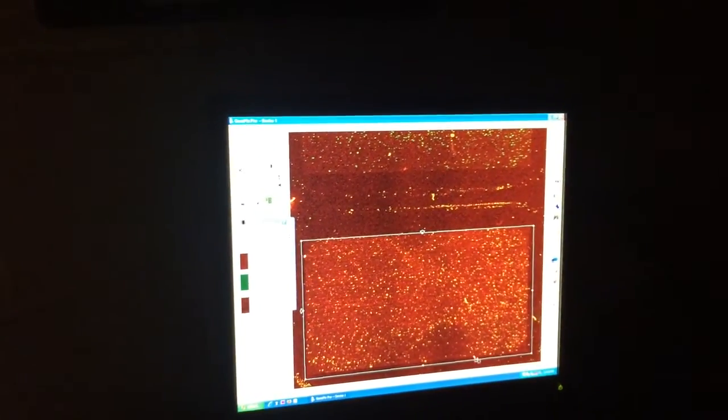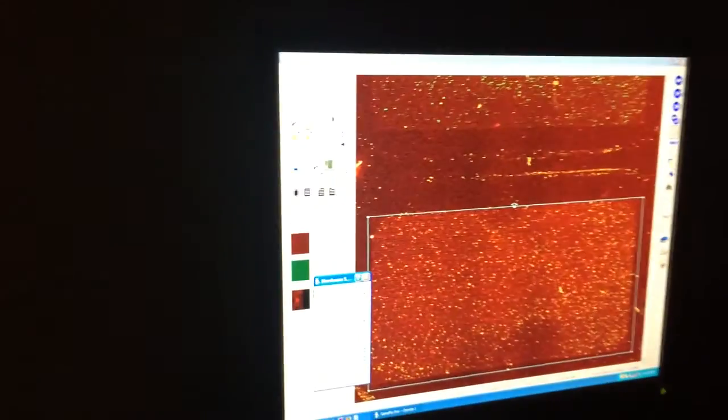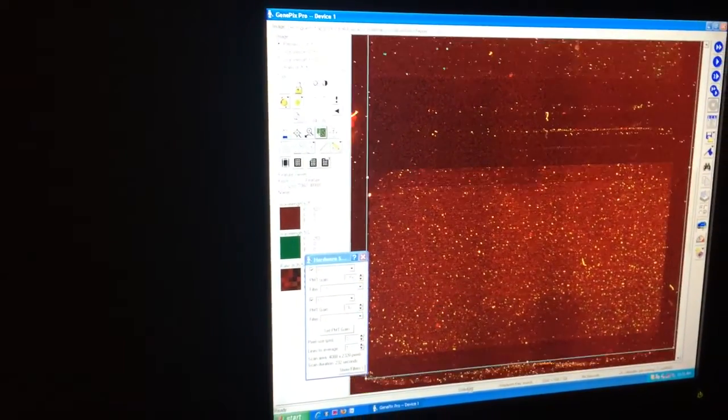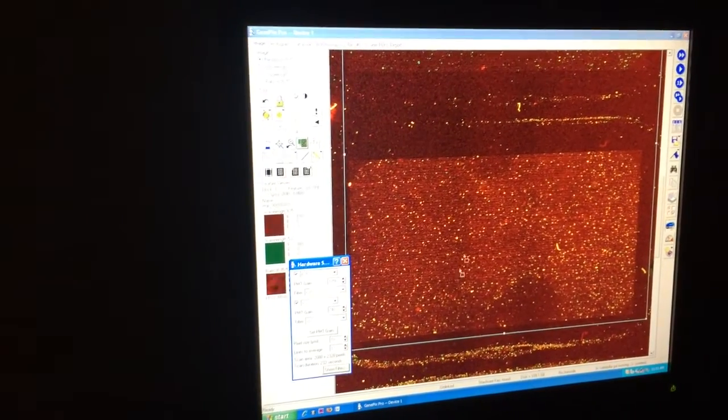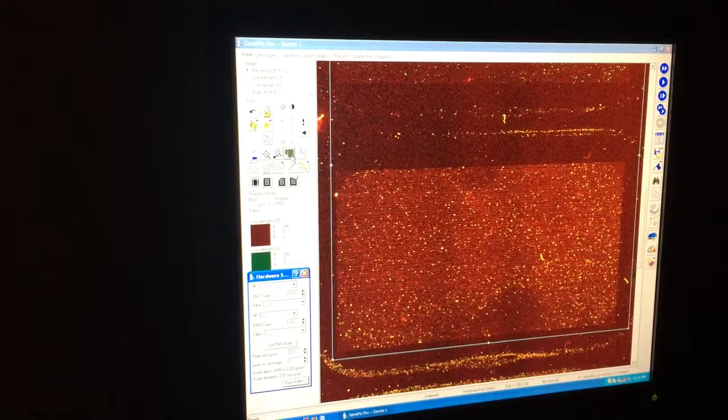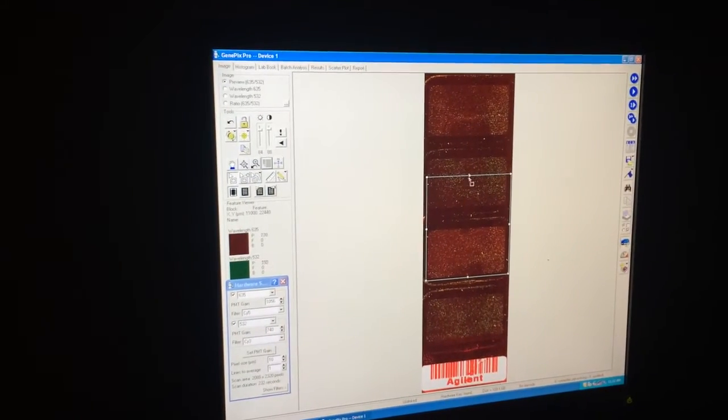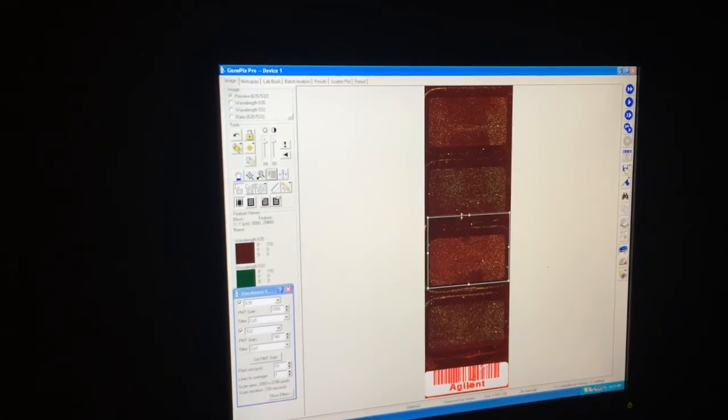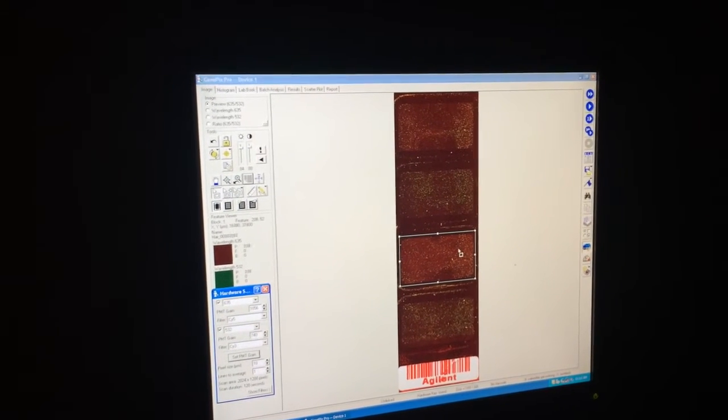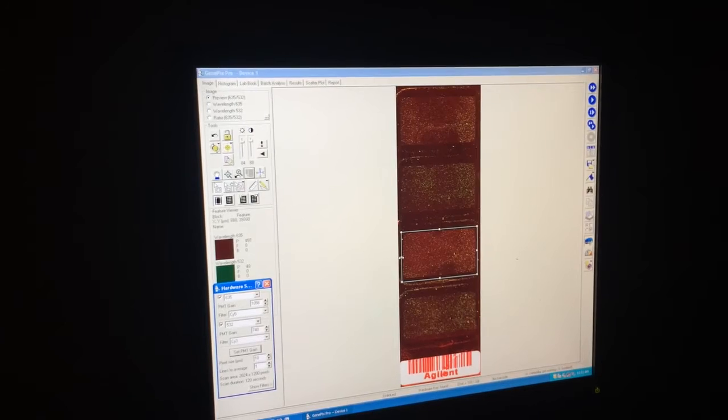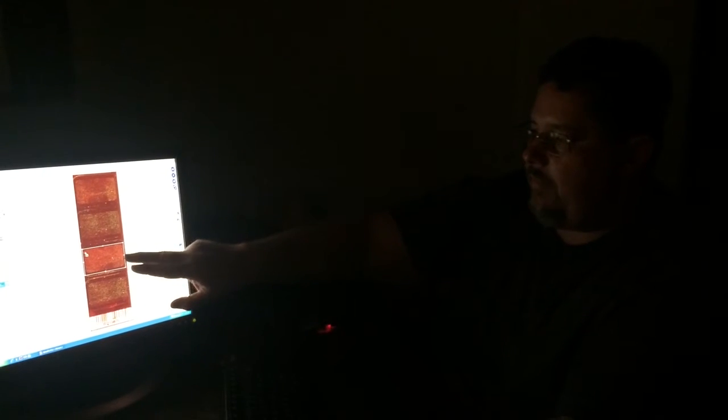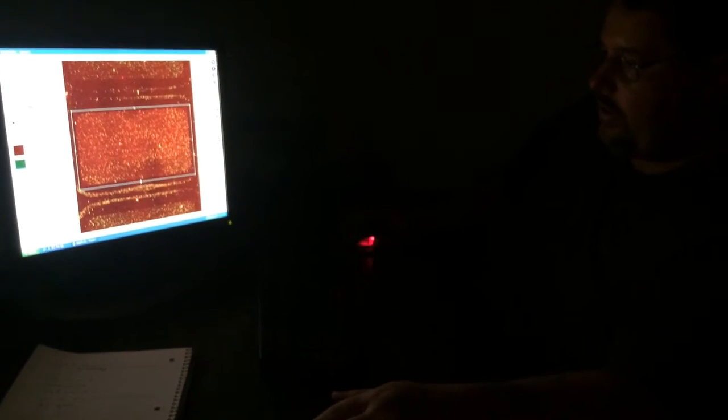So looking at it, it's kind of a mixture of reds and greens. We're going to scan it now on a more refined scale. So now I'm going to hit another button that allows me to do a more fine scale scan. I'm actually going to move this down here. I'm going to hit the overall view. So we're just going to tell it to scan just this array right here. So I'm going to draw this down around the actual block. This saves memory by keeping it just in one little area. Because when you do this fine scale, it takes a lot of memory to take a picture of all of this. So we're just going to try to maximize our computer space by just narrowing into one area that you actually want to scan. And so I just want to make sure that the array is completely covered with our box to indicate where the array is.